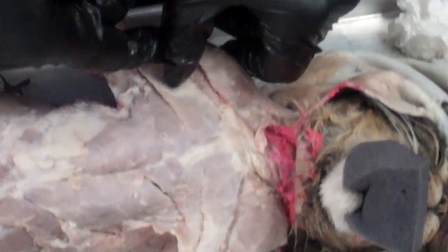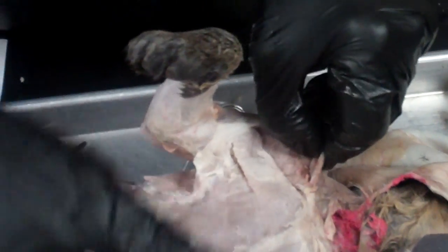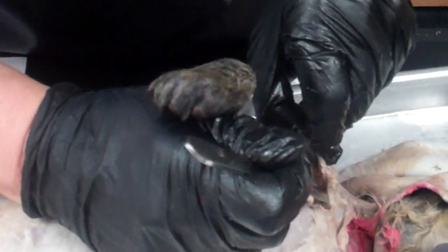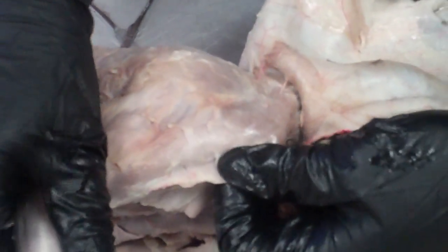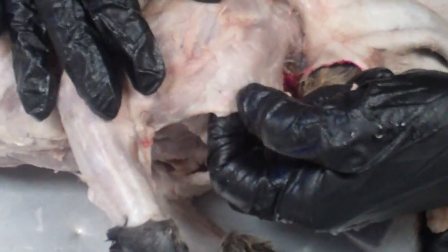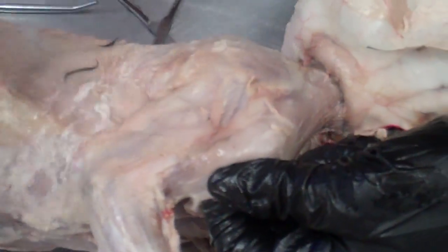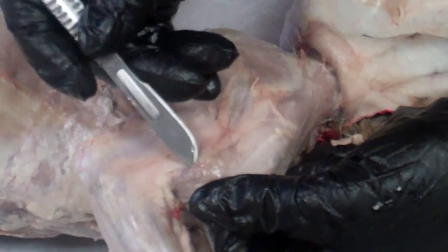That's going to turn into the clavotrapezius as it goes up the neck, and there's a little white line right there that's going to separate these two muscles. In the back, we're going to work with the deltoid muscles first — here I'm lifting up the clavodeltoid and looking for its natural separation.